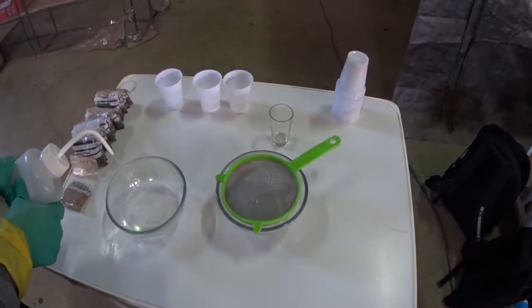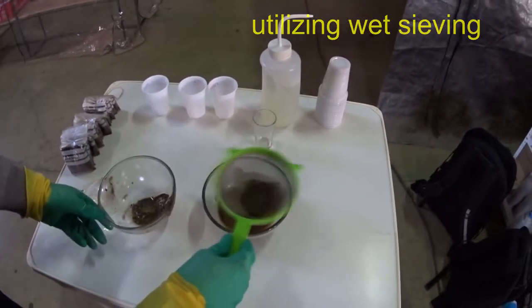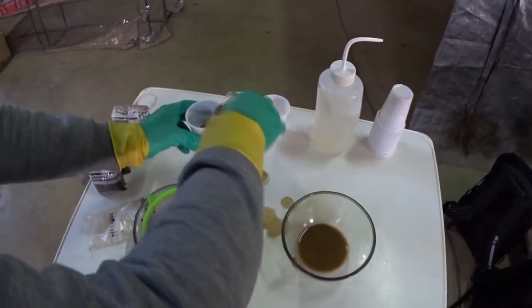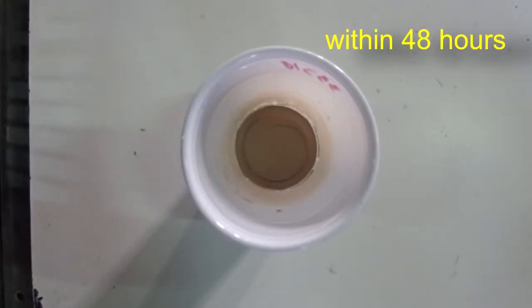Therefore, we developed MEFA. MEFA sample preparation is very simple and could be organized anywhere. Extraction of fine fraction by separating particles in water allows us to avoid nugget distribution of gold, and we can dramatically reduce the size of samples and amount of analyzing material.